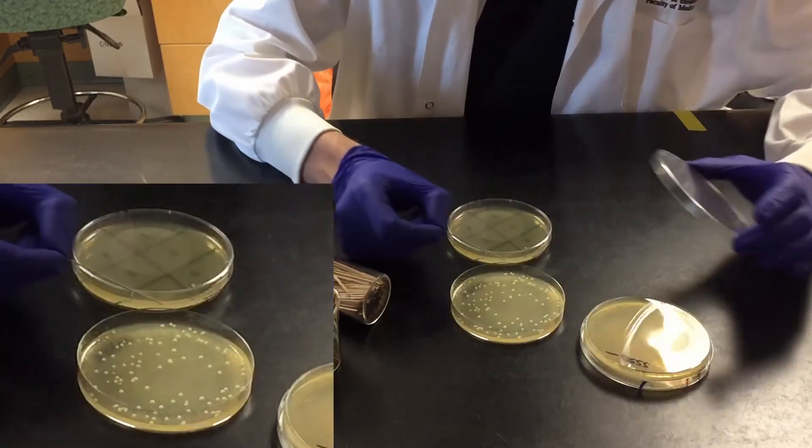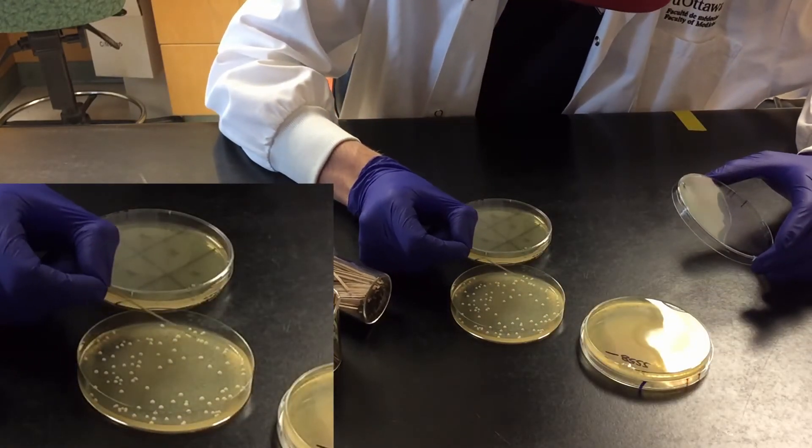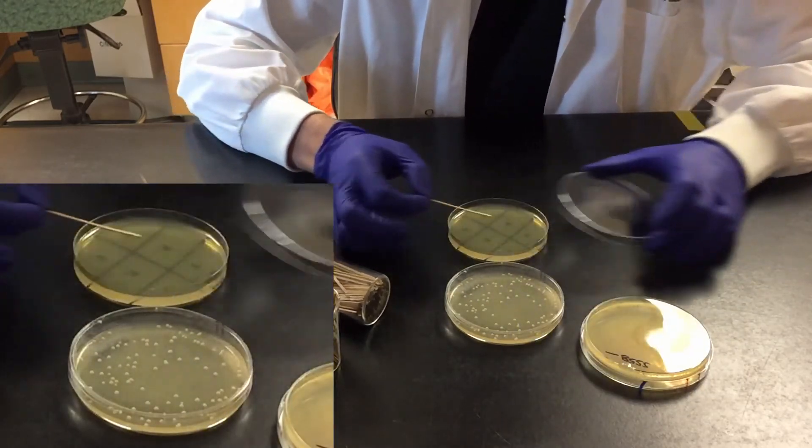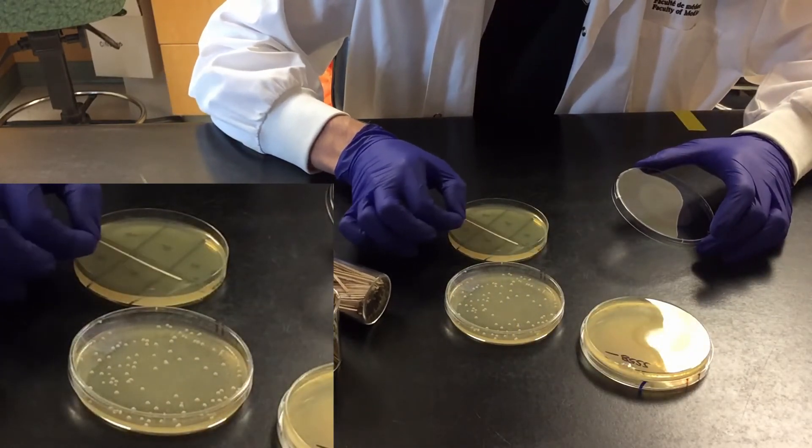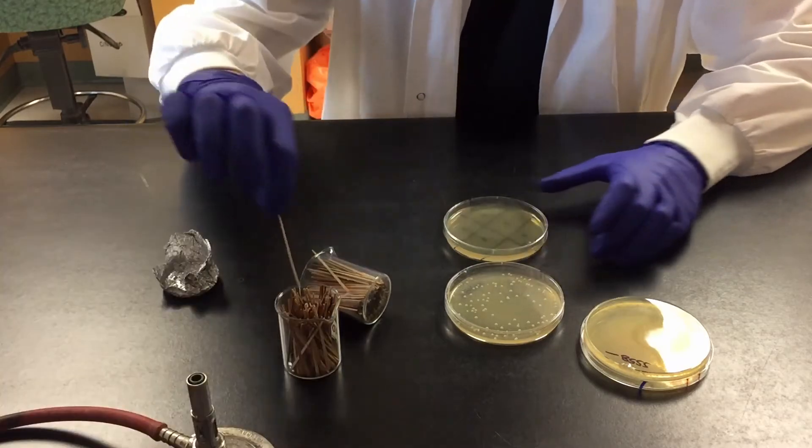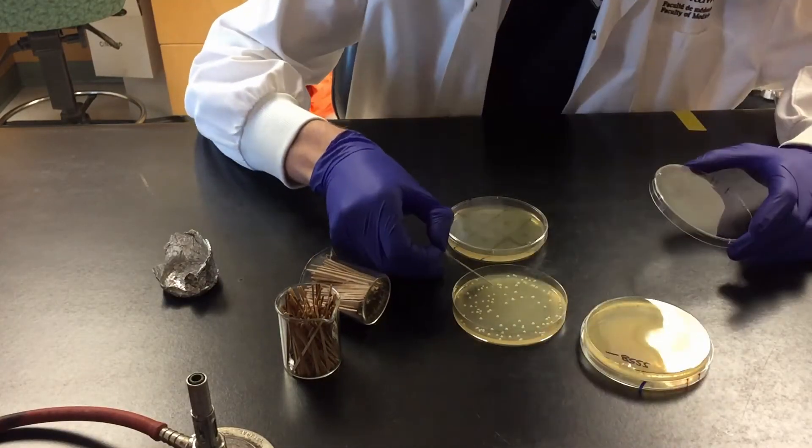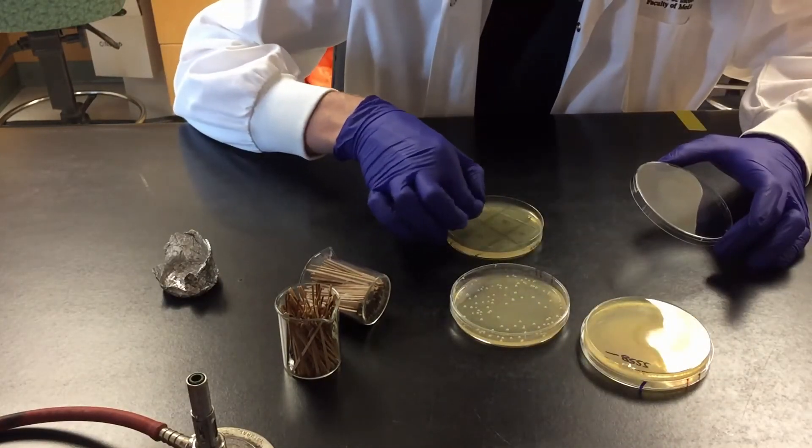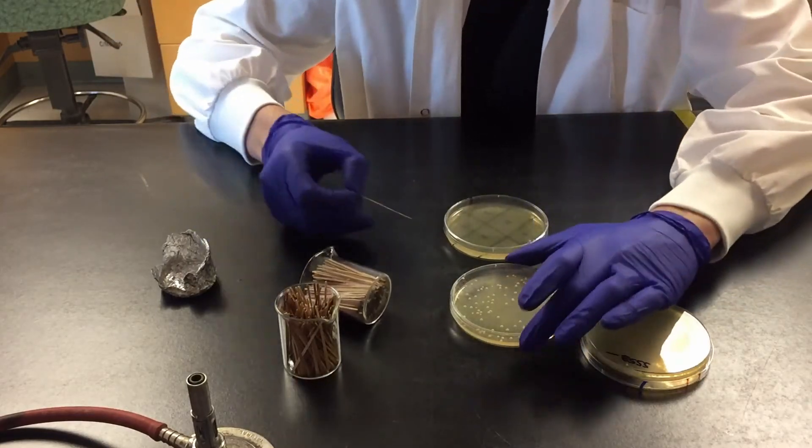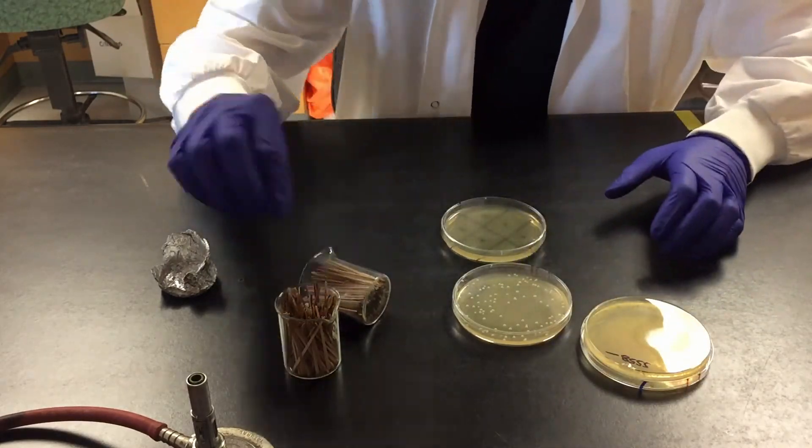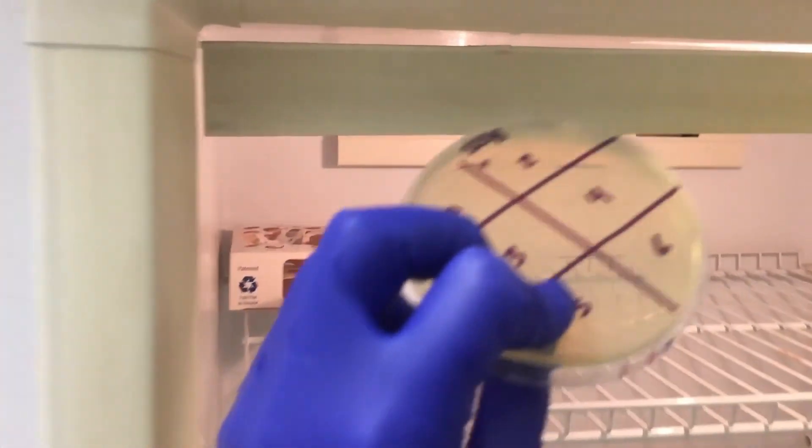Streak a bit of each positive colony onto a new plate with the same selection. Allow the cells to grow into a patch for 1 to 2 days.